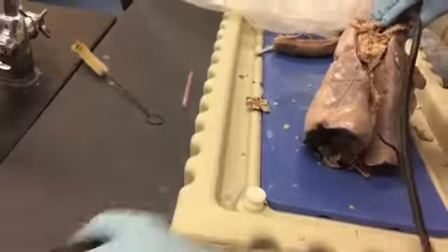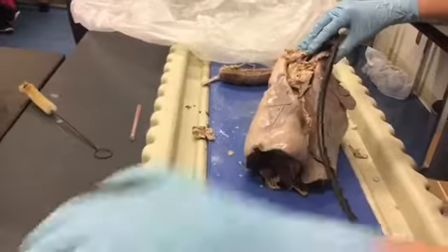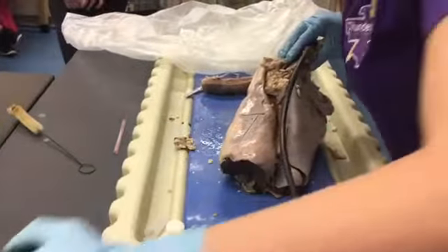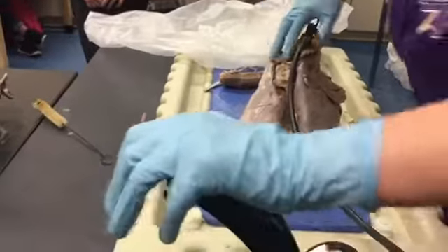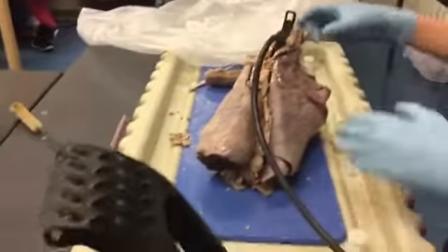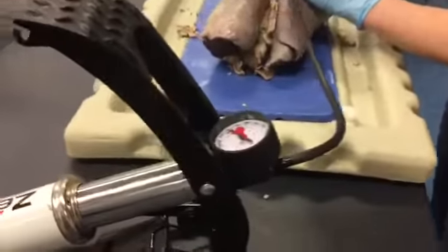Is the air coming out of it? There we go. It will inflate some. So, kind of cool. You can see right up here it's not inflating. Other parts it's not inflating, but that is what your lung looks like when it's inflated. Cool. Partially inflated.